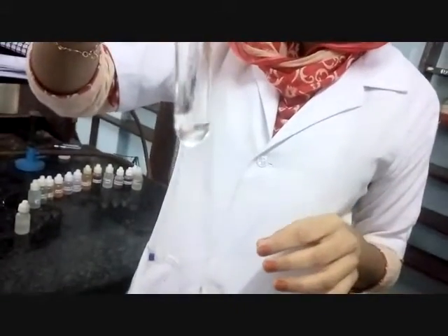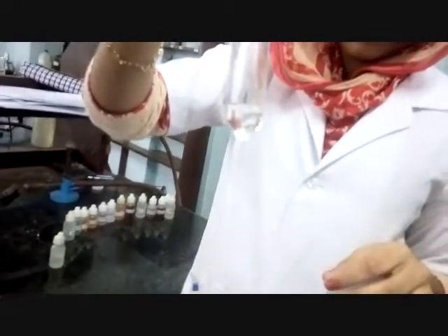Readily soluble in dilute HCl, may be sugar or urea or may be phenol. Note the solubility of the substance in NaOH solution. Soluble in NaOH solution, may be sugar or urea or may be phenol.